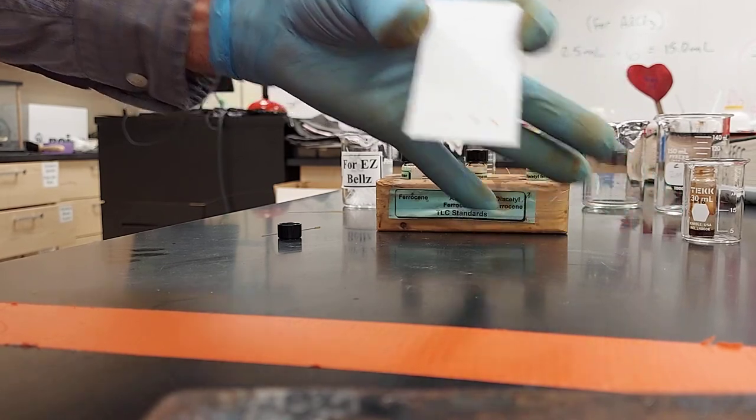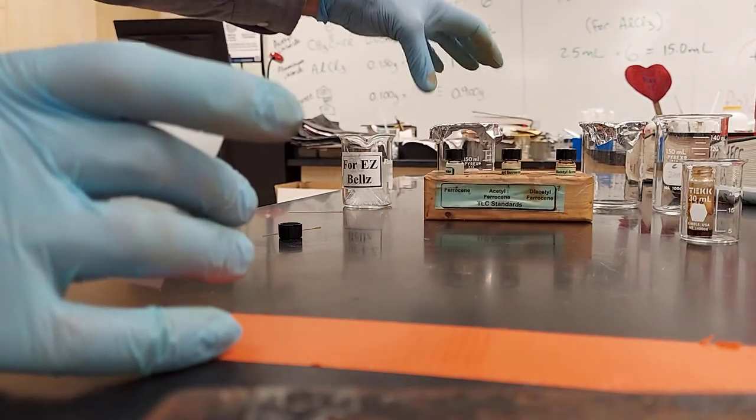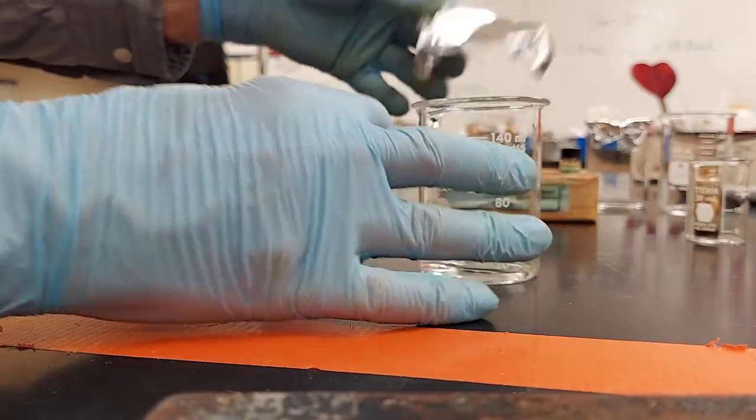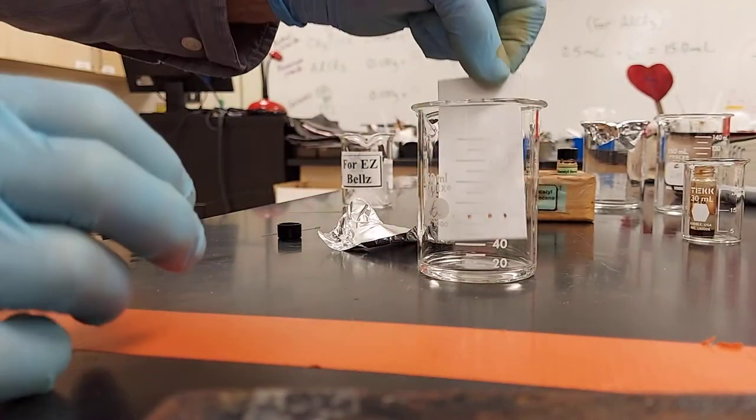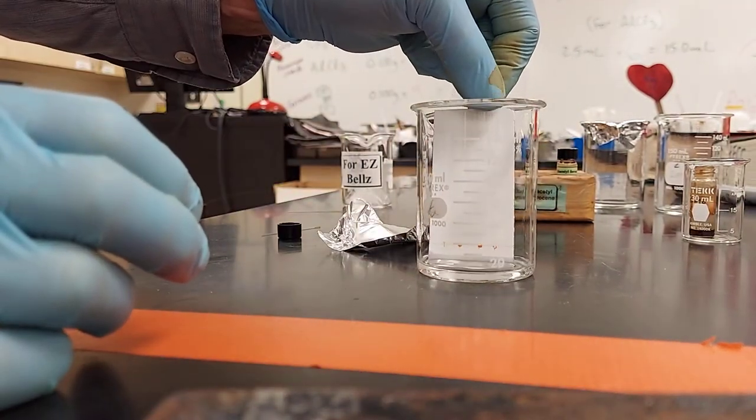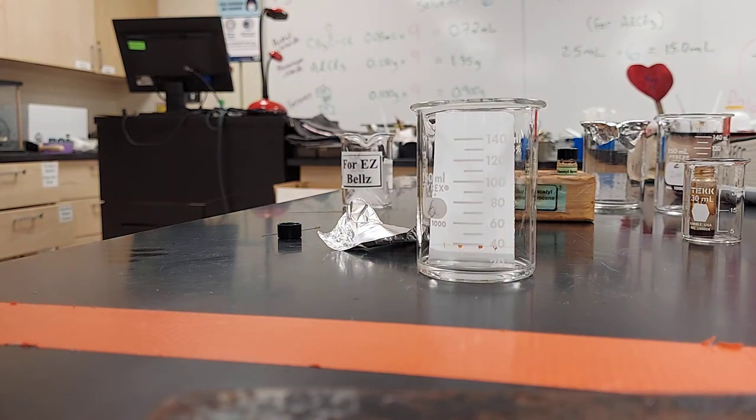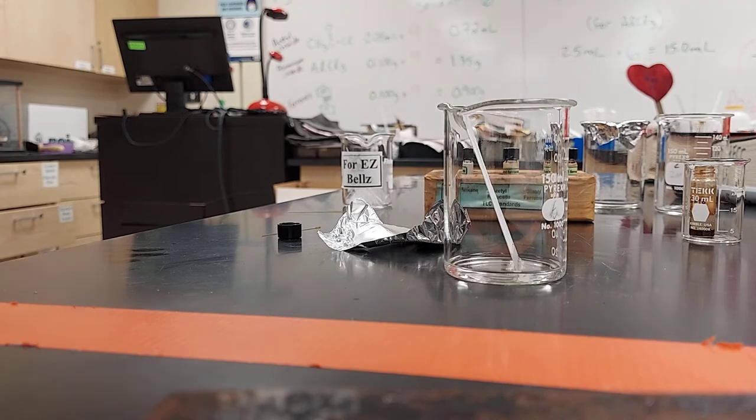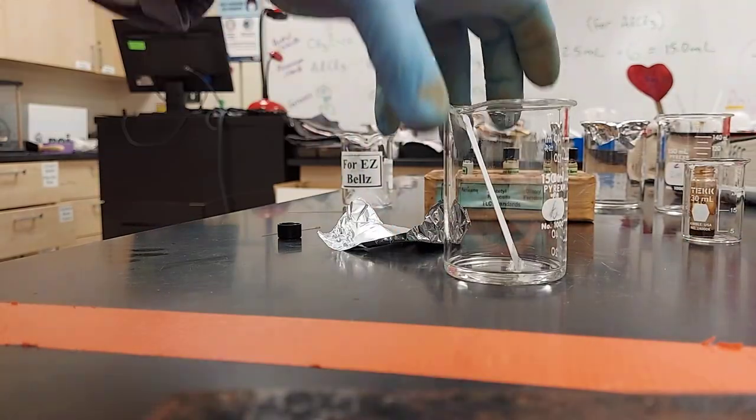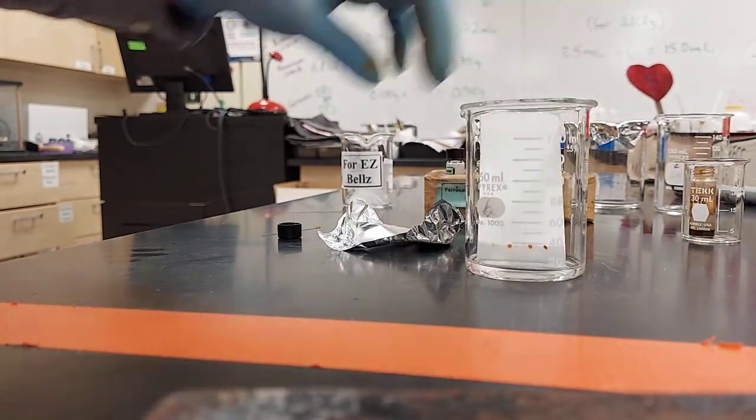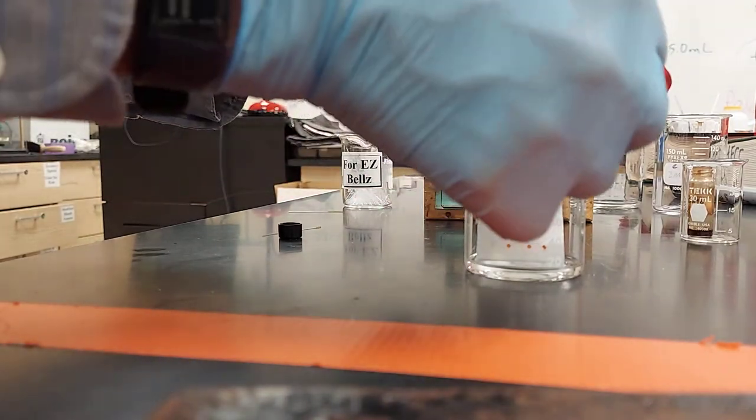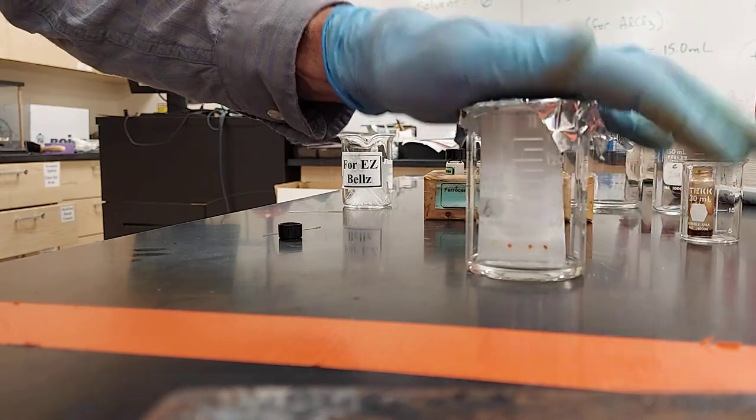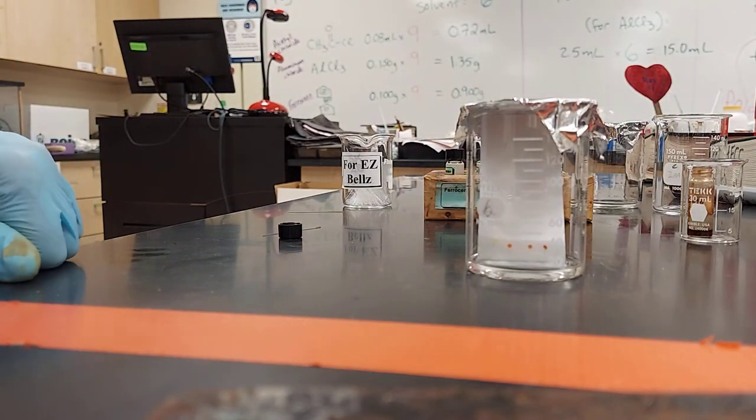So our five minutes are up. We're going to put our TLC plate in here. You want to lean it in there, not on too severe an angle. See how it's not all the way across the beaker? Slight angle. And put the lid on. Make sure it's snug by using your whole palm.